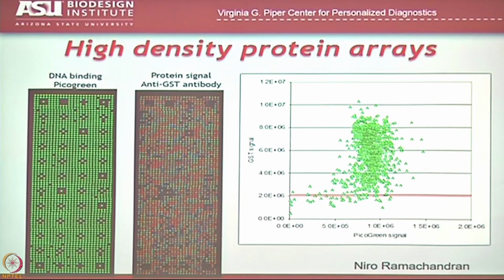Secondly, if you look from the top of the expression to the bottom of the expression, the entire range is within one order of magnitude. So instead of those protein arrays where the lowest amount of protein to the highest amount of protein would be over 4 orders of magnitude, now all of our protein is within a single order of magnitude. In fact, 93% of these spots are within twofold of the mean, which means that we're getting very even levels of protein on the chip. And remember, one of the things we wanted from an ideal array was to have very consistent, even levels of protein.